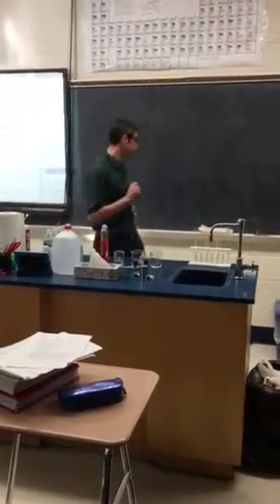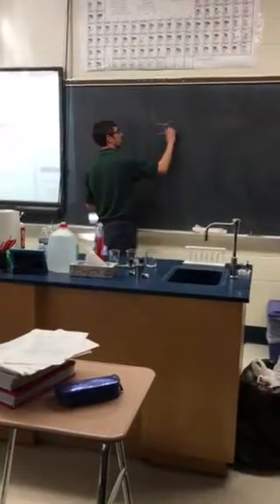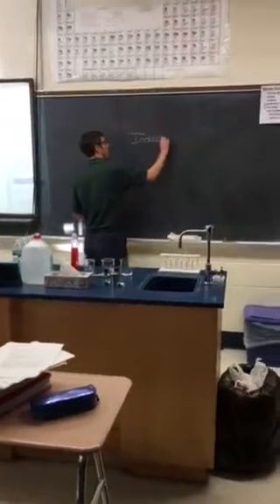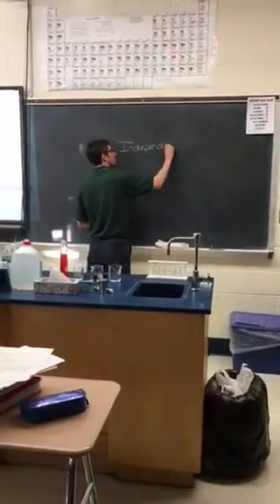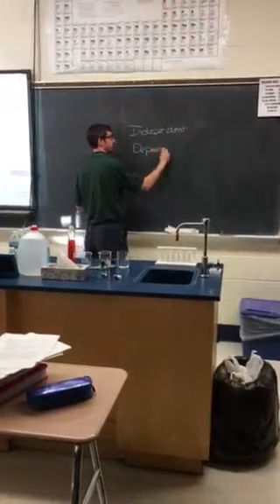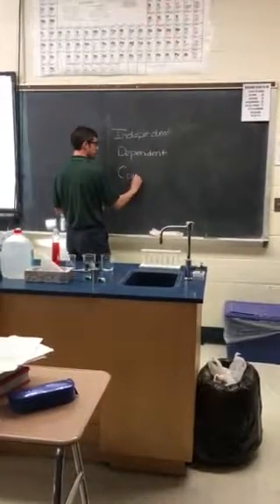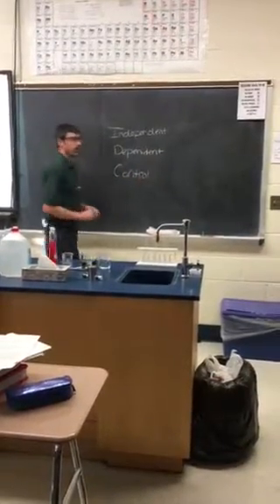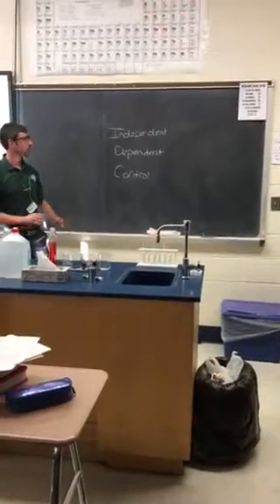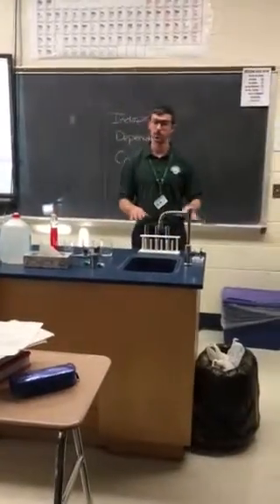and what they are. So we have the independent variable, the dependent variable, and then our control. So we have our 3 water samples. They're going to be at equal volumes, and there's going to be an equal amount of soap deposited in each test tube.